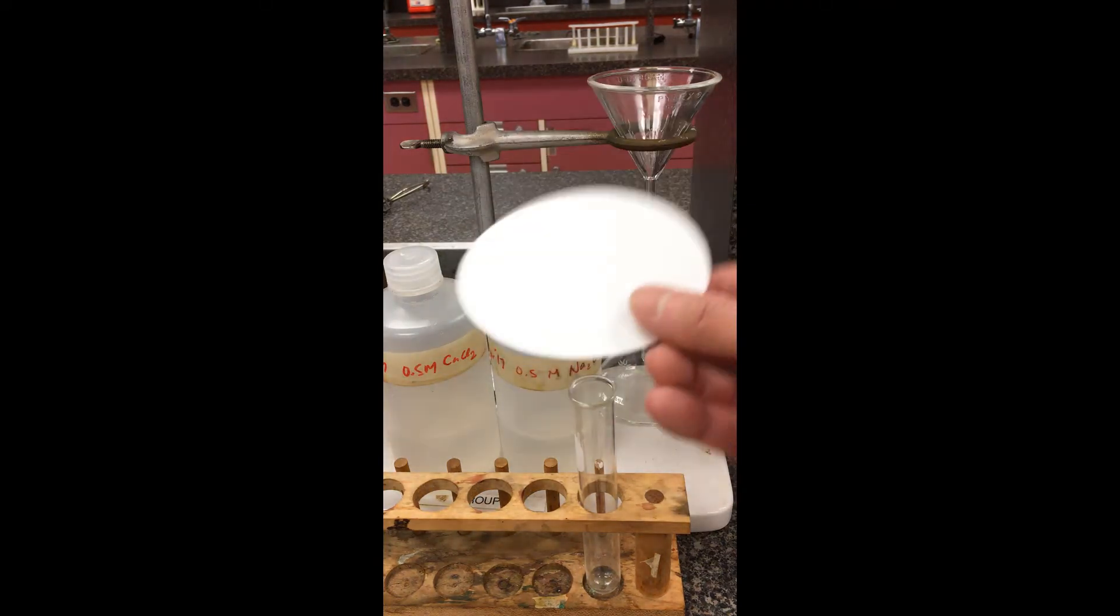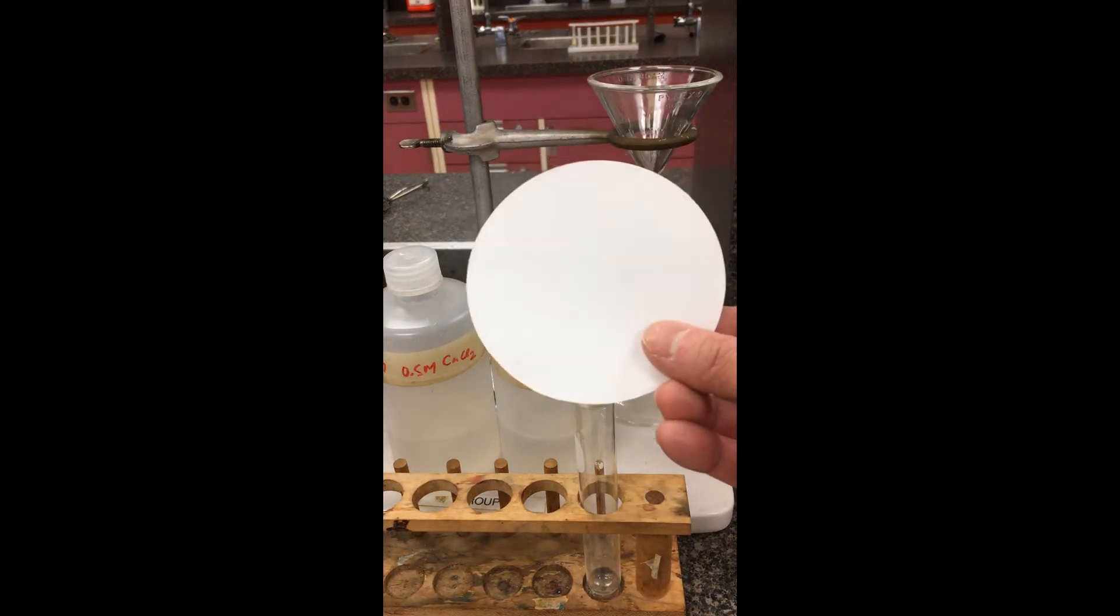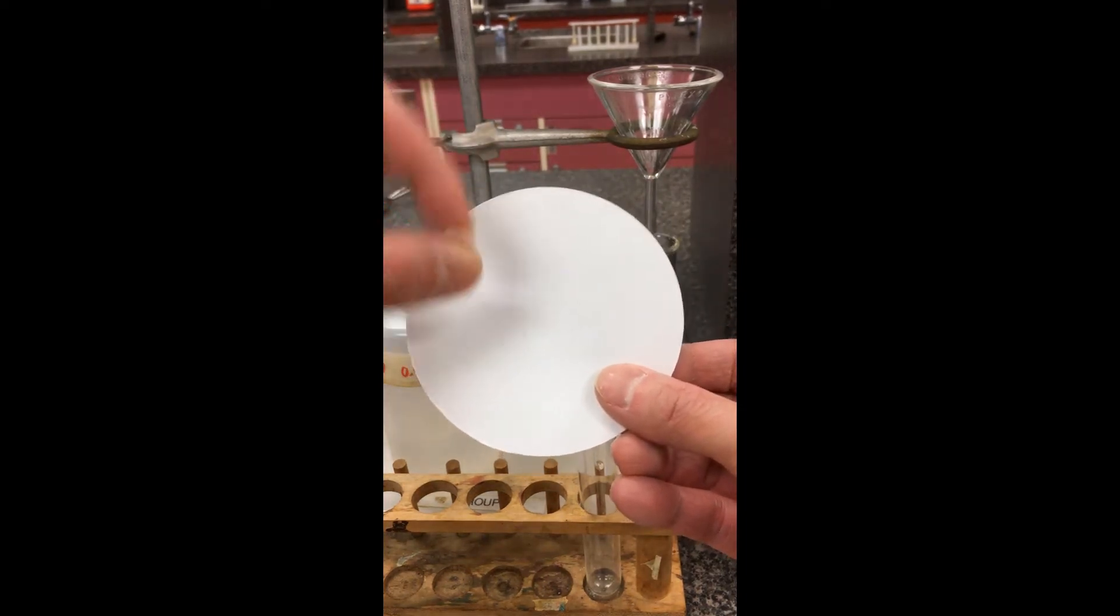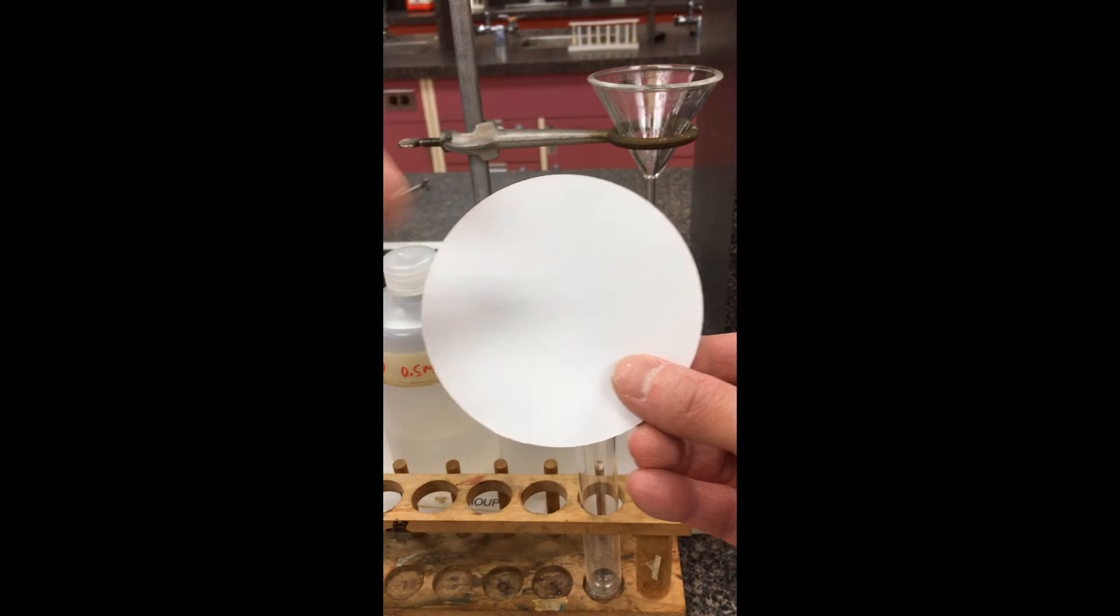I have here a piece of filter paper. They come in all different shapes and sizes depending on the grade of the filter paper. There are these microscopic pores that will actually vary depending on how large the residue is going to be.